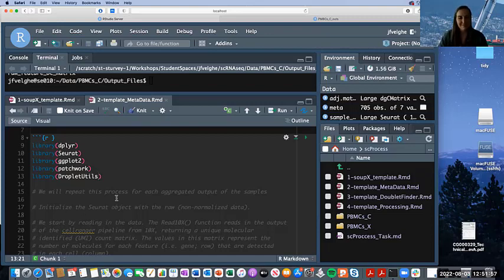Outside of Sockeye, you kind of just follow the same steps for installation. Some of them take longer than others to install, and they have a lot of dependencies. So for neat and tidy stuff, it's nice being able to run this on the server, because we have all the packages we need and we can add to it, and then people can still refer to our single-cell RNA sequencing library container for other single-cell RNA sequencing that people do.